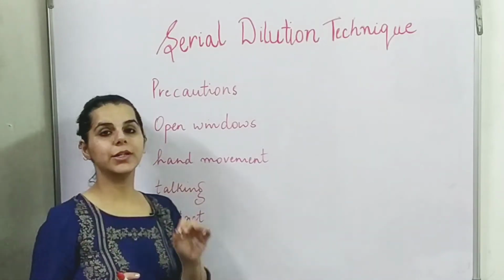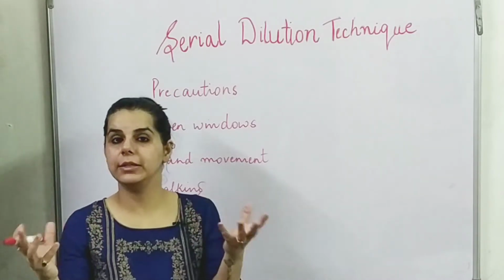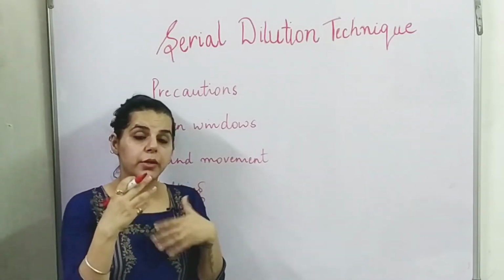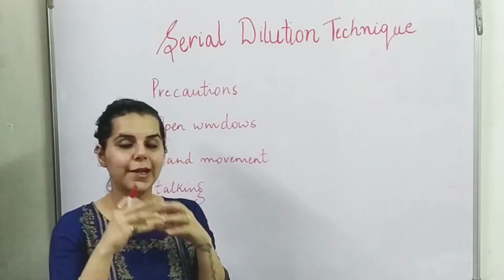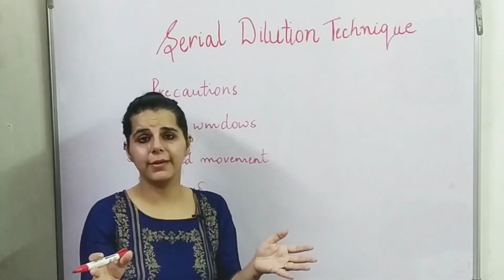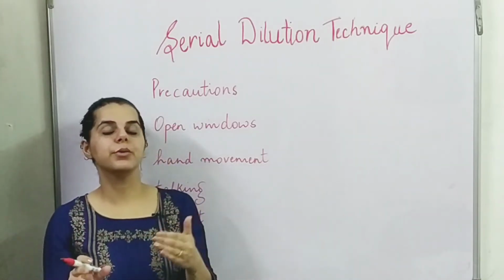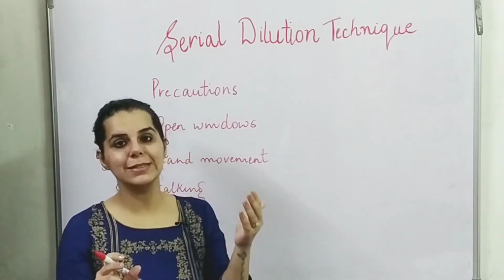Another very important thing is that you must not talk while you are performing any of the techniques, because our mouth has air, and then air again has microorganisms, and then you may end up contaminating the whole thing. So it's better not to talk when you are performing these techniques, right?